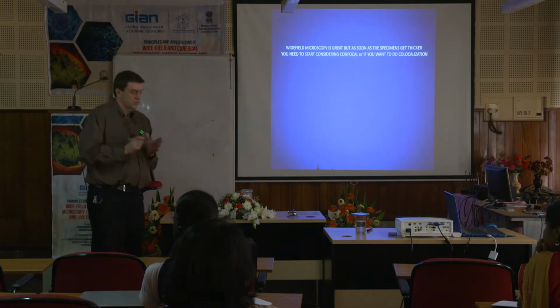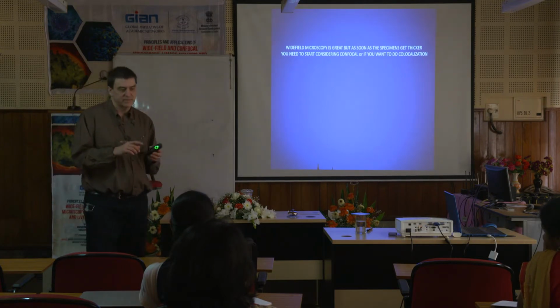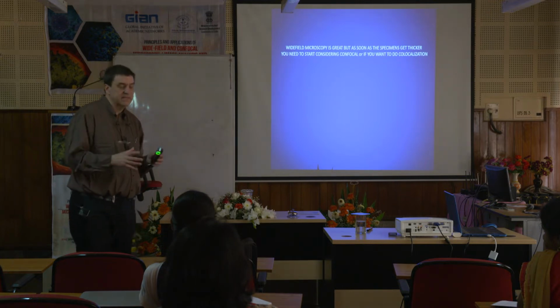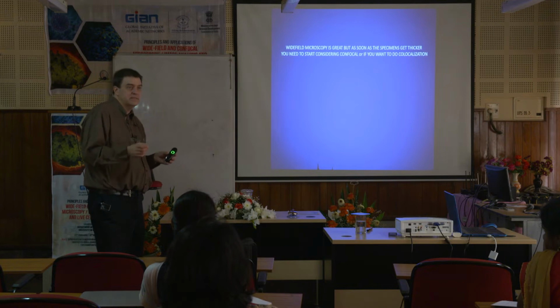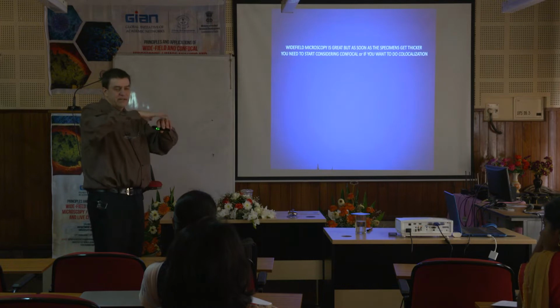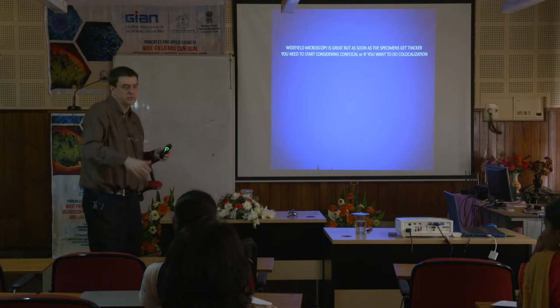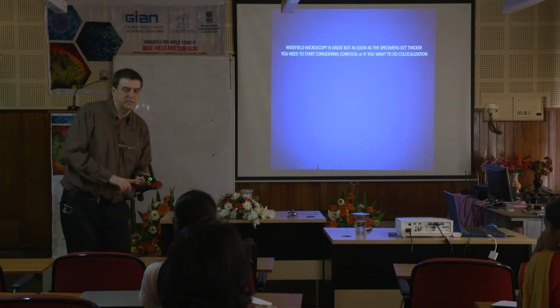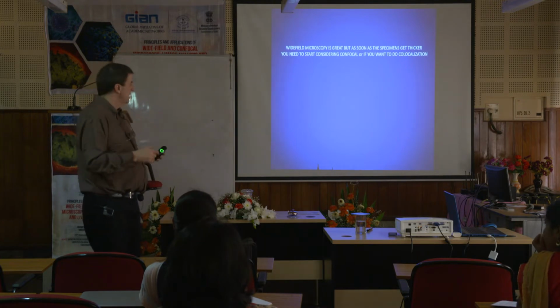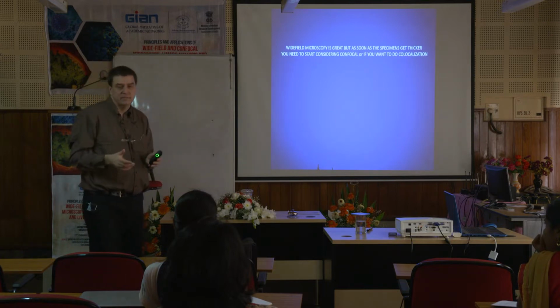Okay, so what we talked about yesterday is wide field microscopy, and I showed you some of those pictures where I deconvolved the cells and they looked really nice. And wide field works great on cells and thin pieces of tissue because it works on things that are thin. If something's thicker, the light's going to go into it and the light's going to get bent by all the molecules in there, all the carbohydrates, all the proteins, all the fats. The light's going to get scattered in numerous directions. And with the wide field, you're going to get more blurring because everything's getting bounced all over. The light's getting bounced in many directions.